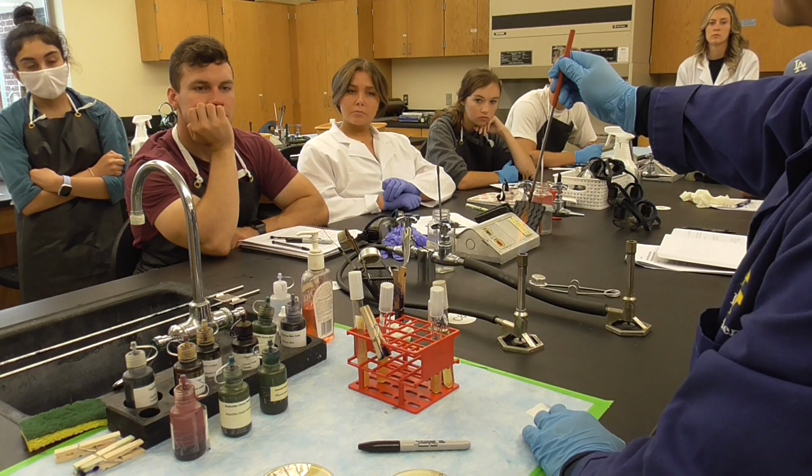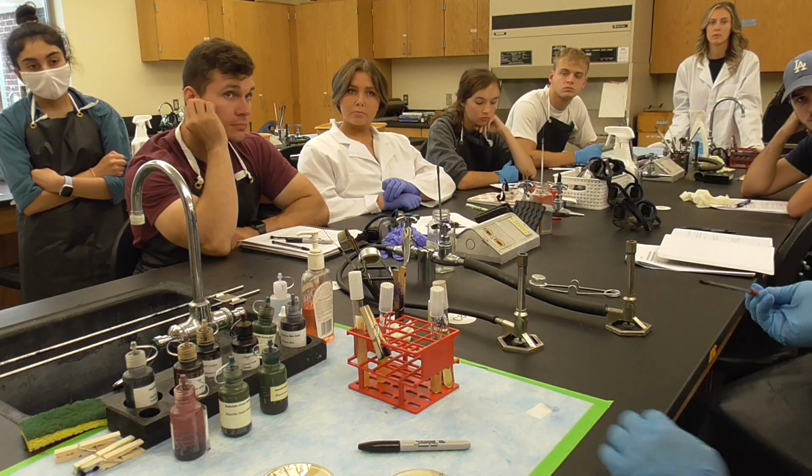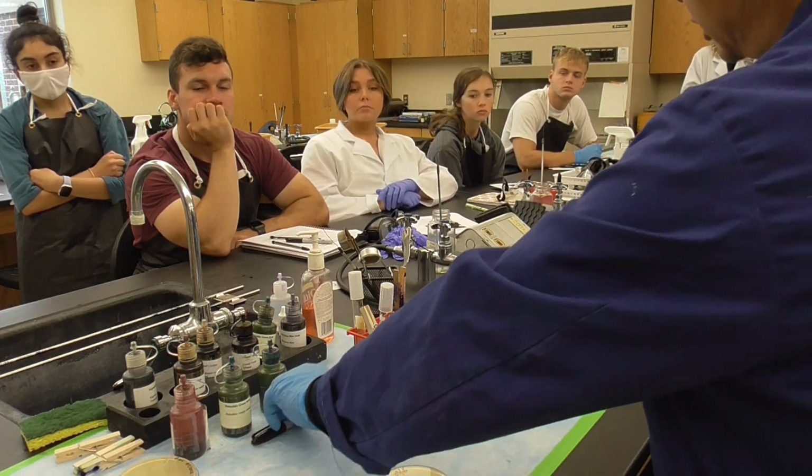These two will be given to the TA, and will be incubated at 35 degrees Celsius for 24 hours. Sometimes we'll do a little bit longer. It will be 48 hours sometimes.